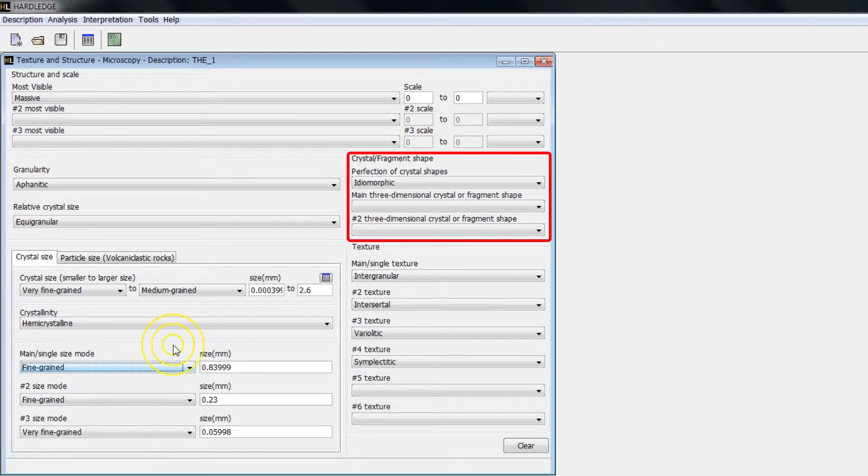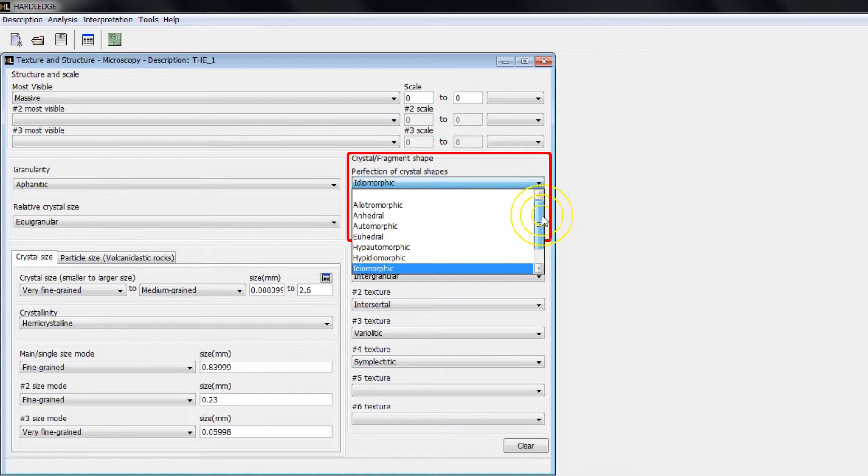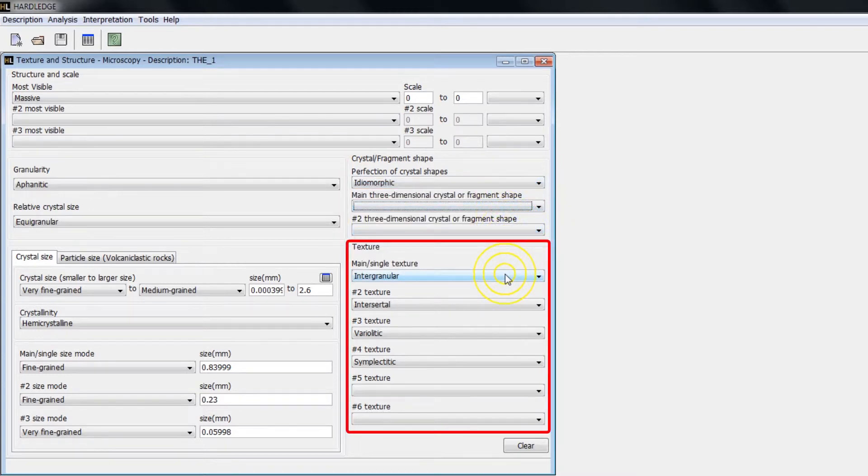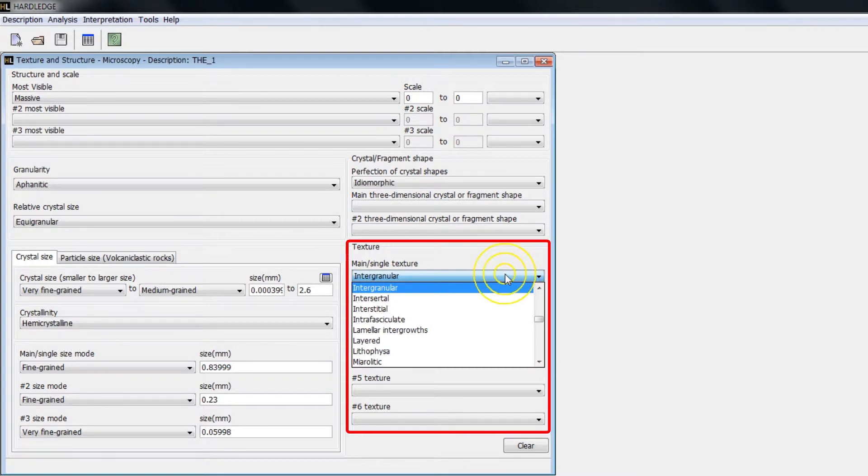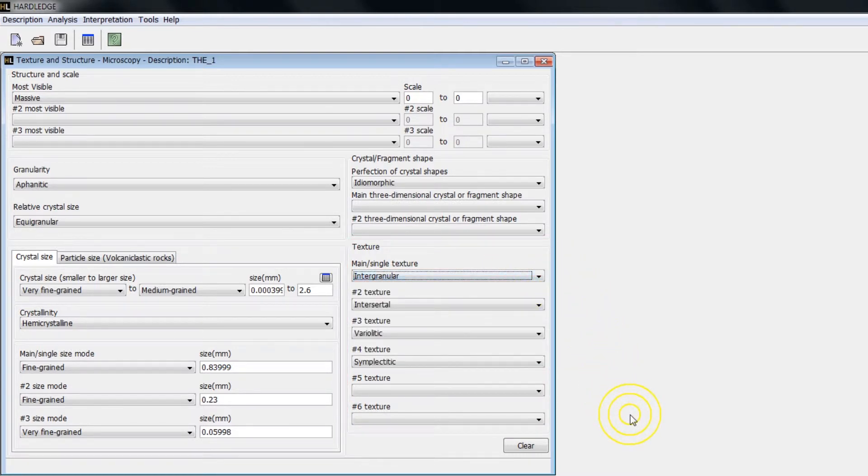In Crystal Fragment Shape, choose the desired perfection of crystal shapes and the tridimensional shape. In Texture, choose the main single texture. It's possible to add up to six different textures.